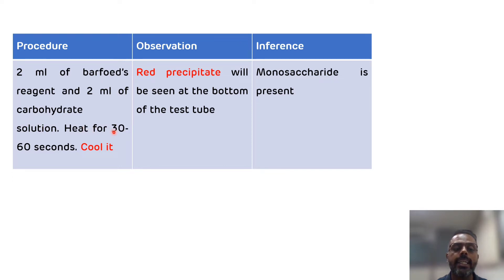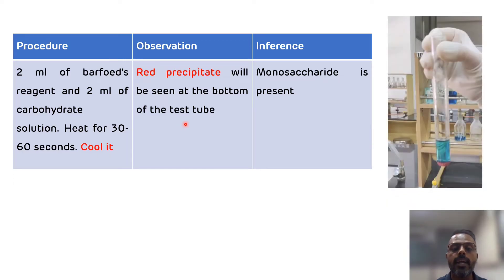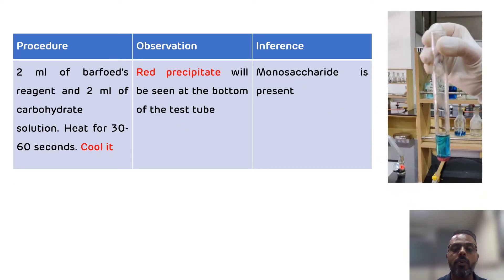After mixing, heat for 30 to 60 seconds, then cool it. After cooling down, if there is a presence of red precipitate at the bottom of the test tube, that means monosaccharide is present and Barford's test is positive. This is how the red precipitate will look like. That is all about Barford's test.